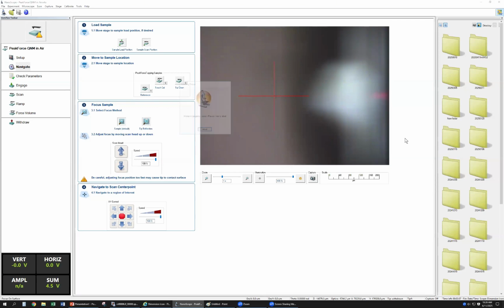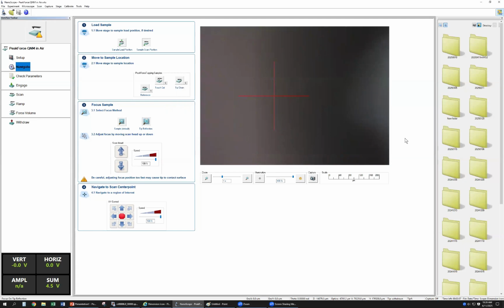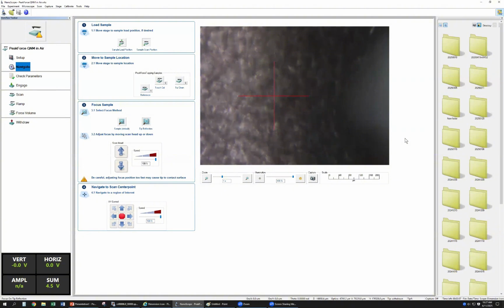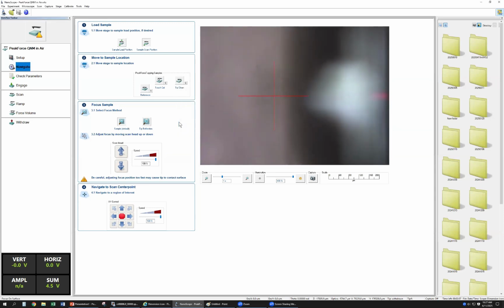It's far away, huh? Right, a little closer. Okay, almost, almost here. Yes.